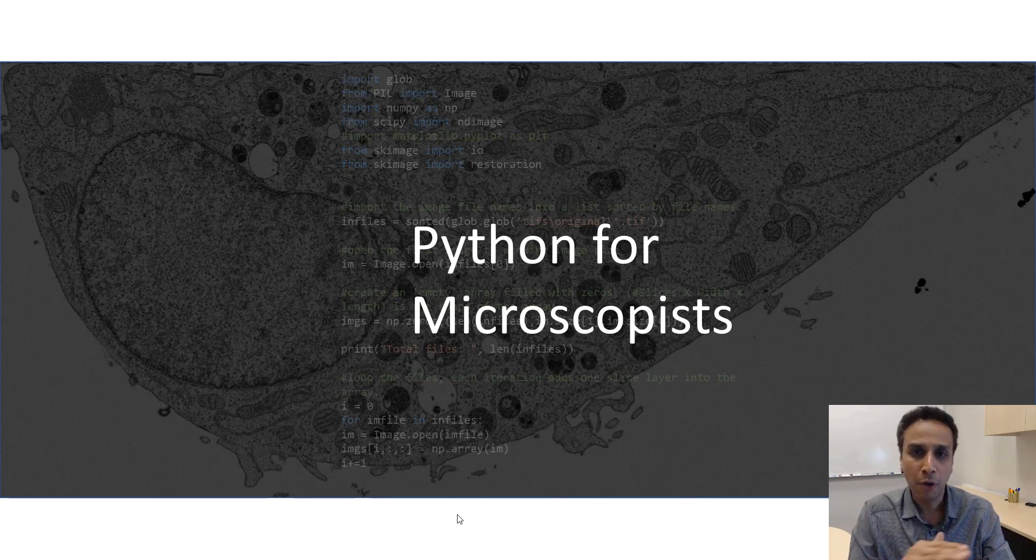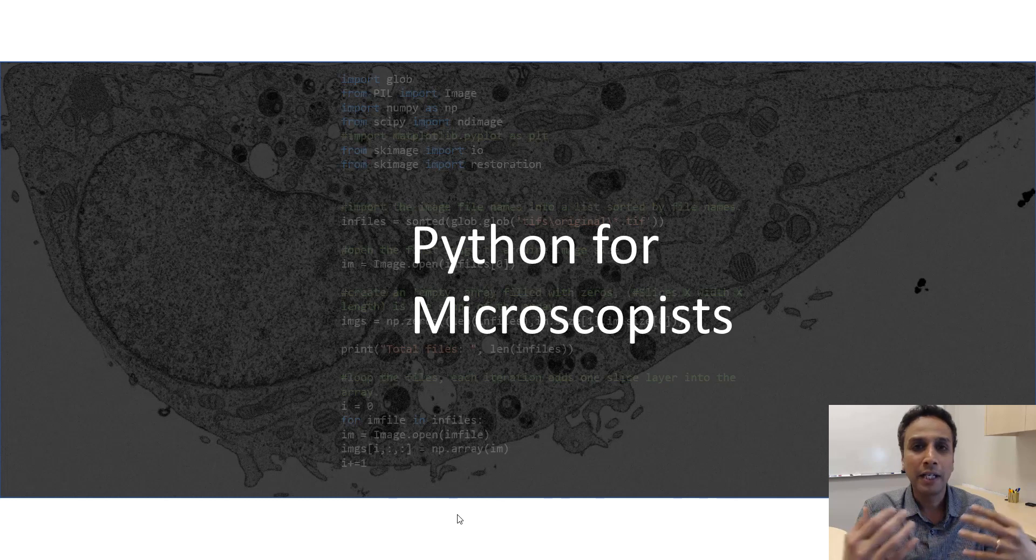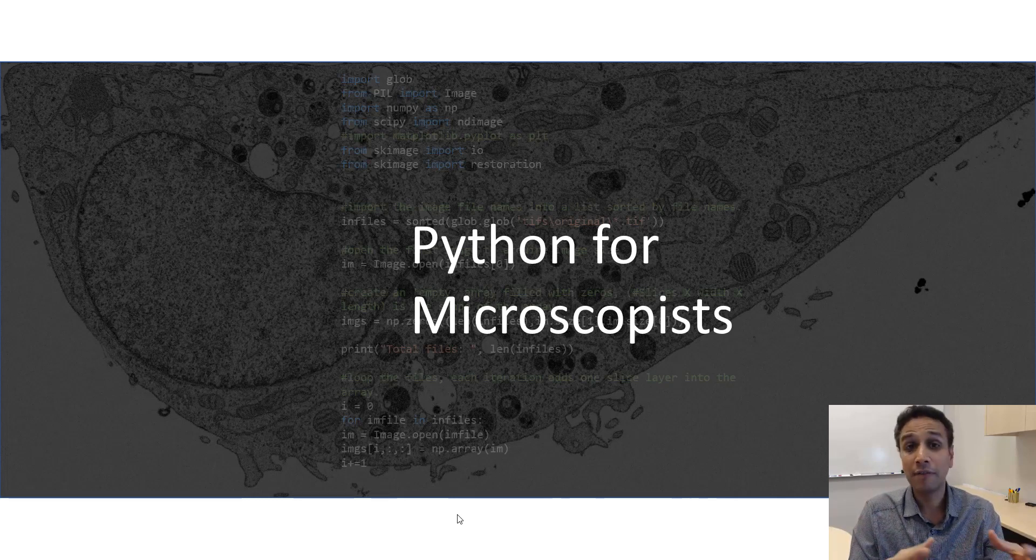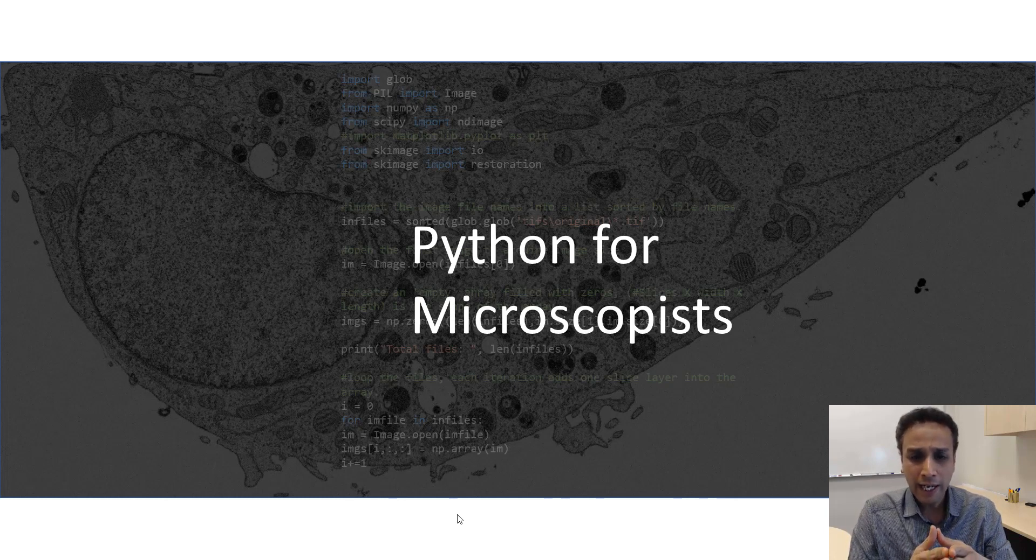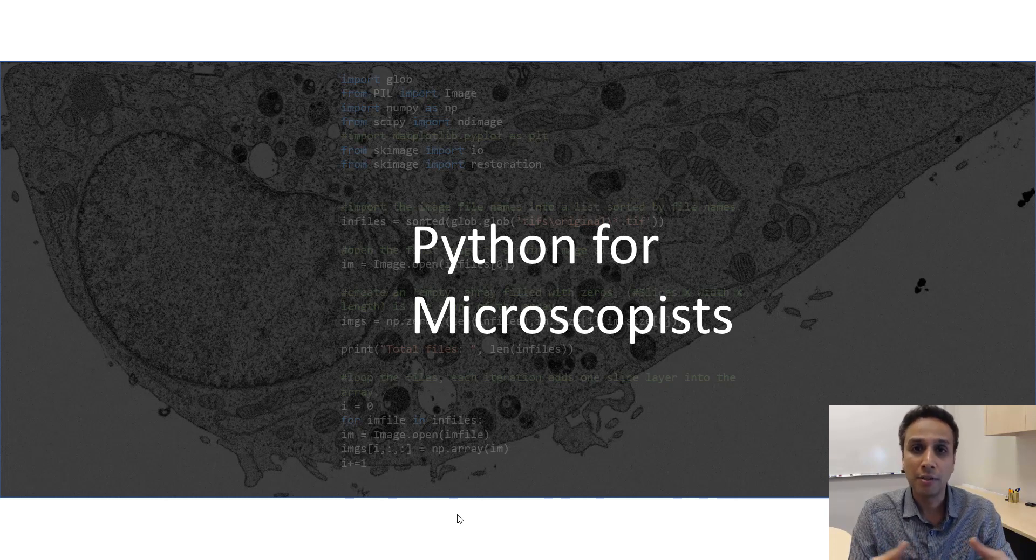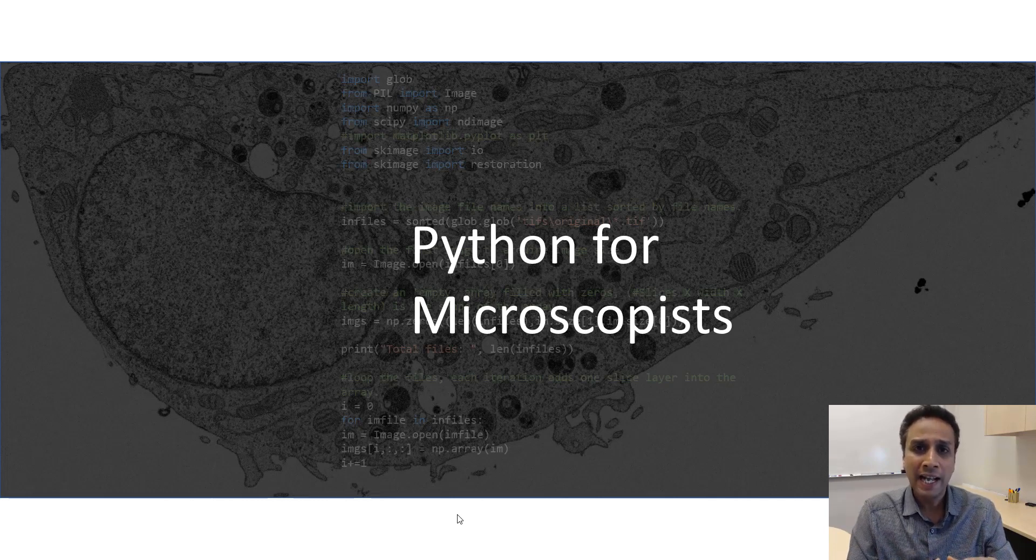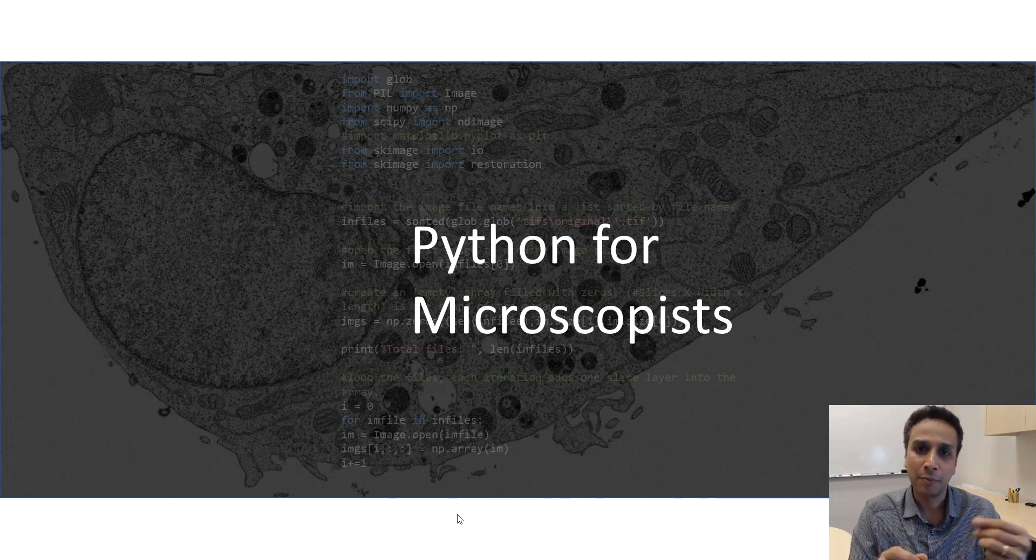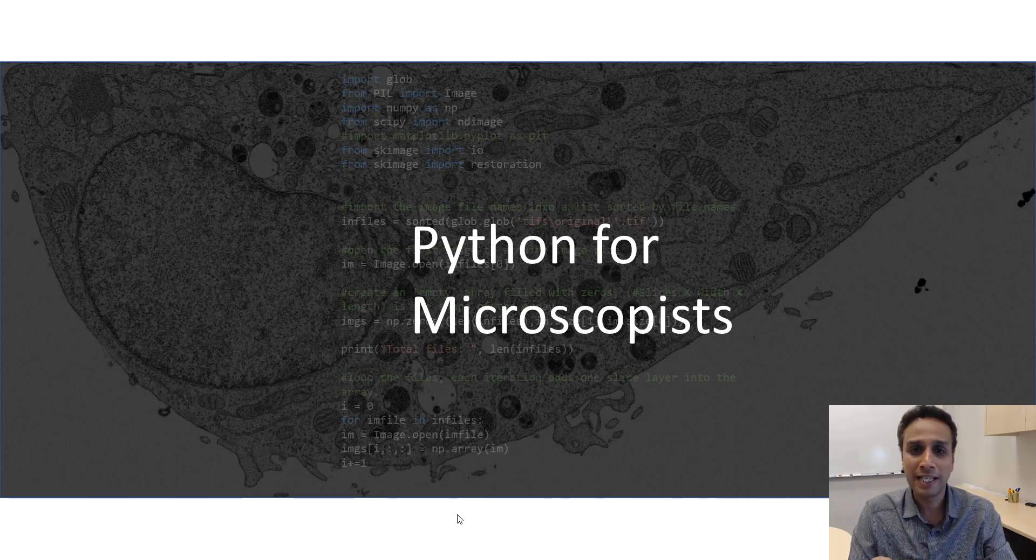The image contained a bunch of grains, possibly from an alloy which would be a metallurgical sample, a polished surface, or it can be geological, a rock with large or smaller grains. The images could be from a light microscope or an electron microscope. This tutorial is a slight extension of the previous couple of tutorials.